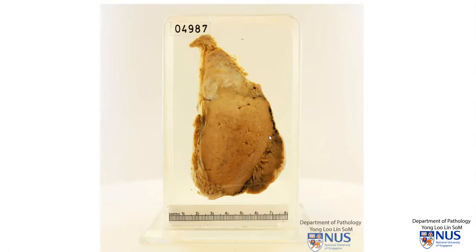In summary, we have an invasive breast carcinoma that is about 6.5 centimeters in maximal dimension that is involving the skin locally. And in the TNM staging system, this is a T4B tumor.